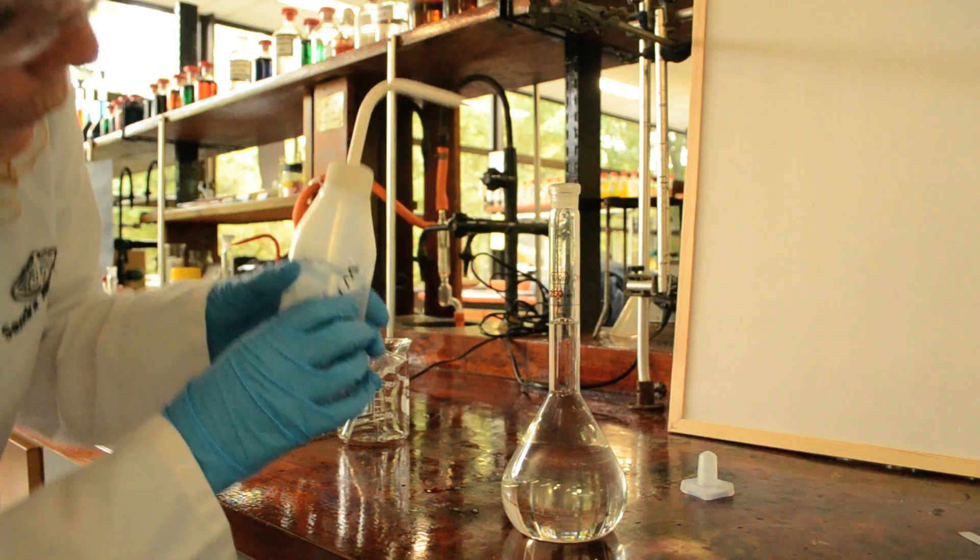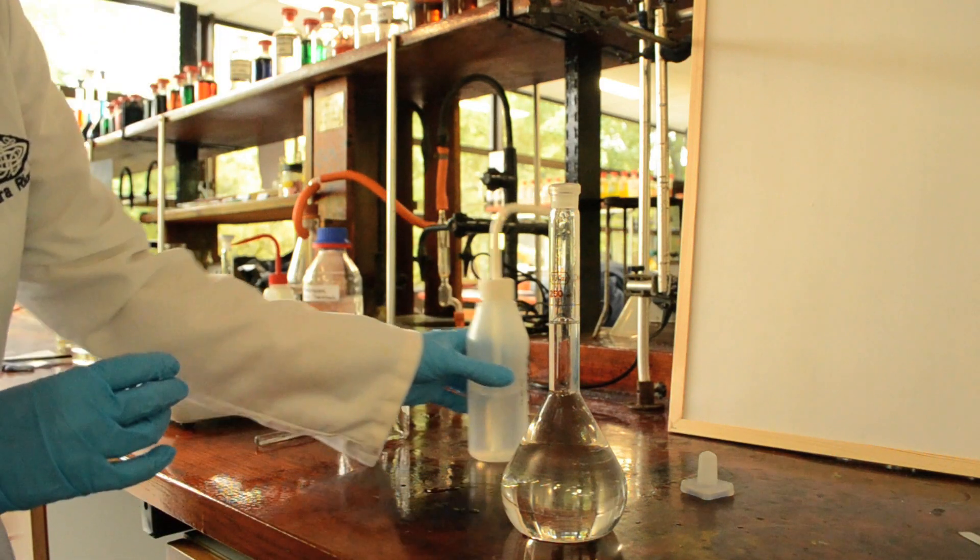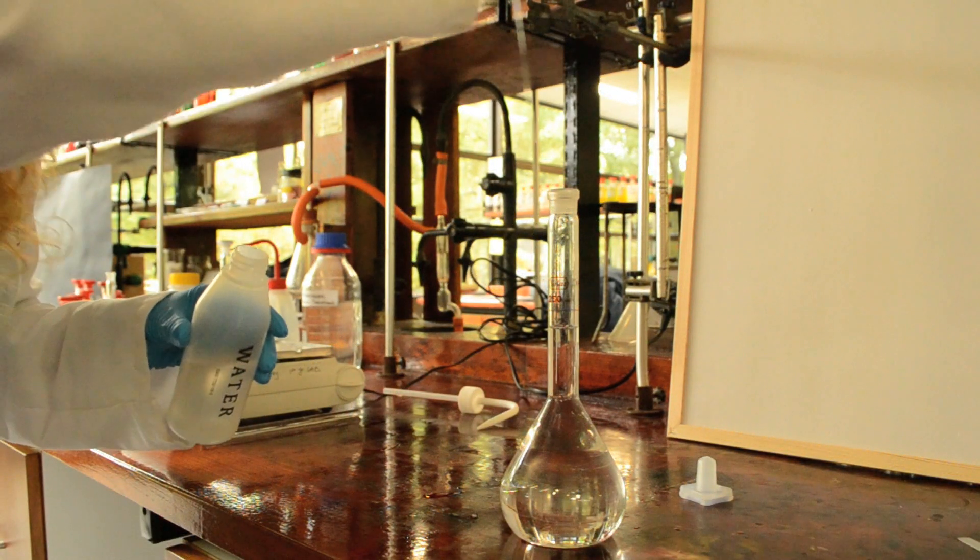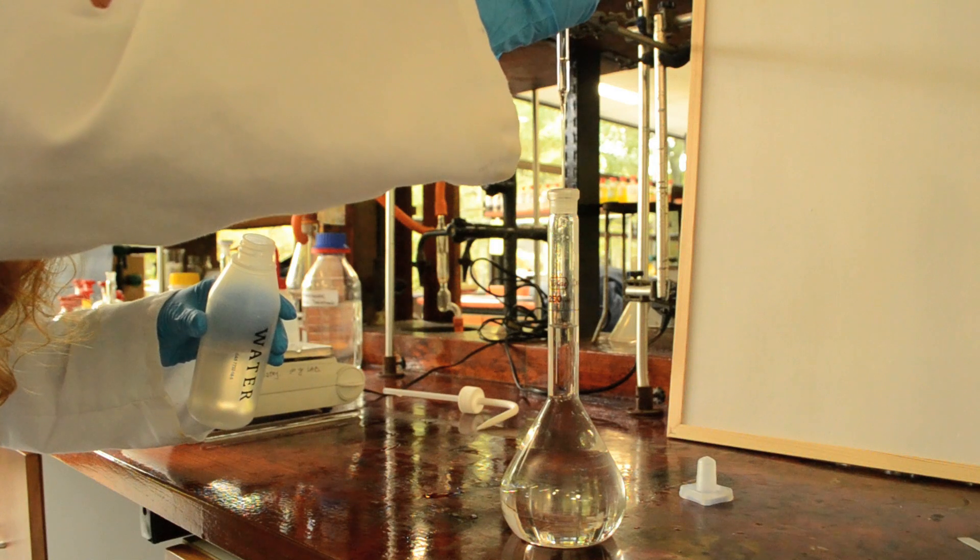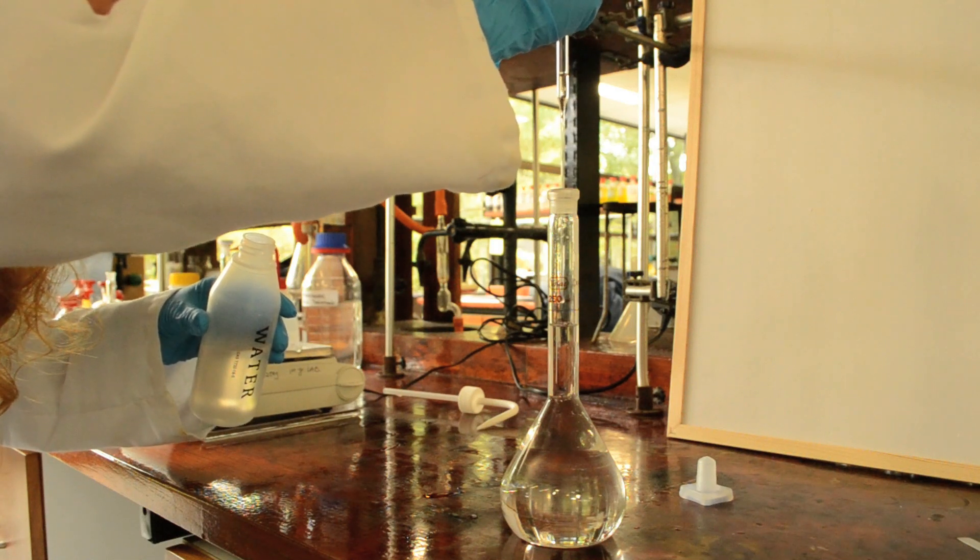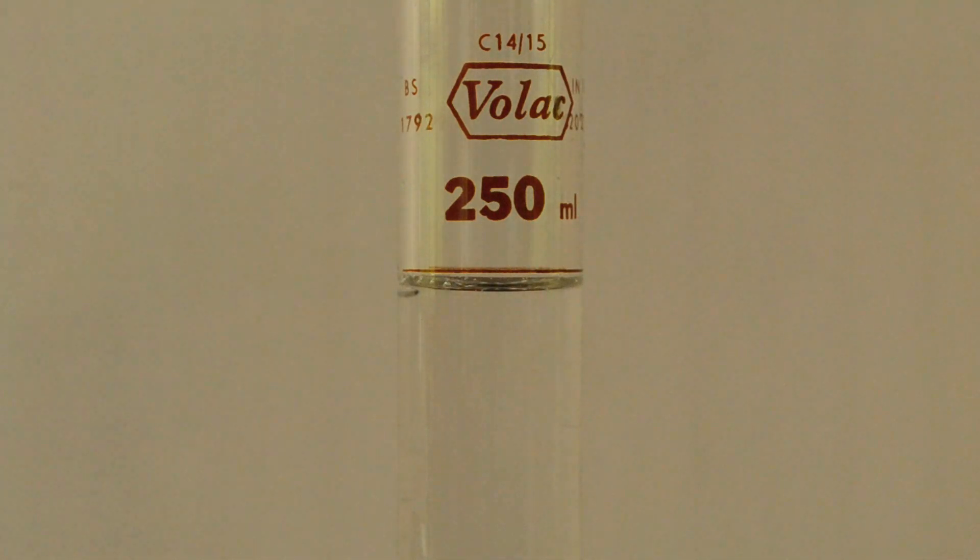So once I get to within 1 cm of the graduated mark, I stop. I carefully bring the bottom of the meniscus up to the graduation mark, adding dropwise, and making sure my eyes are level with the graduation mark.